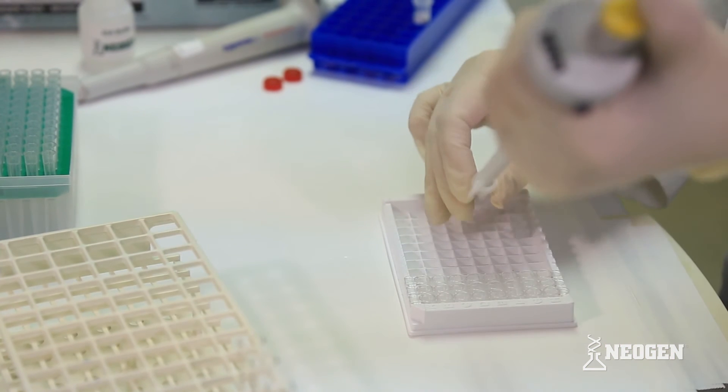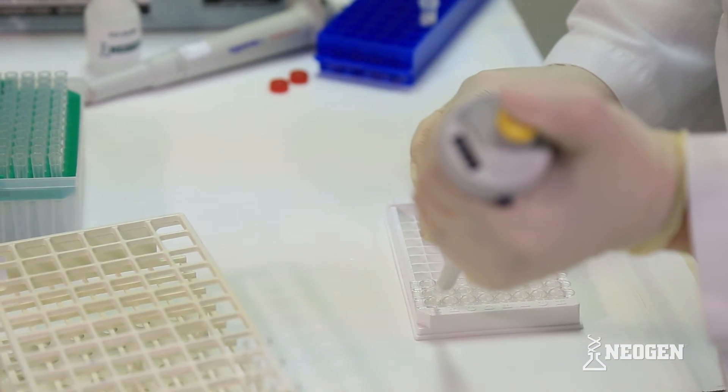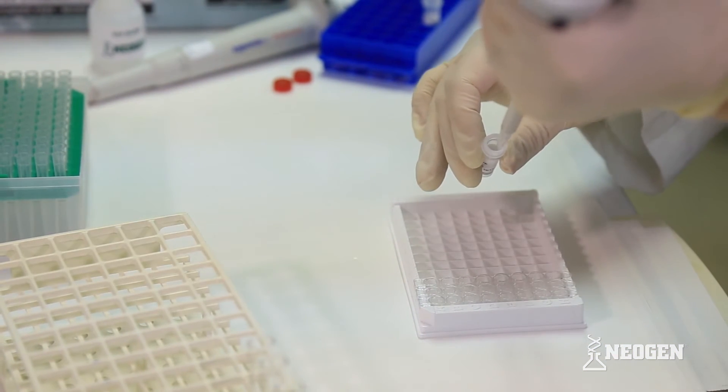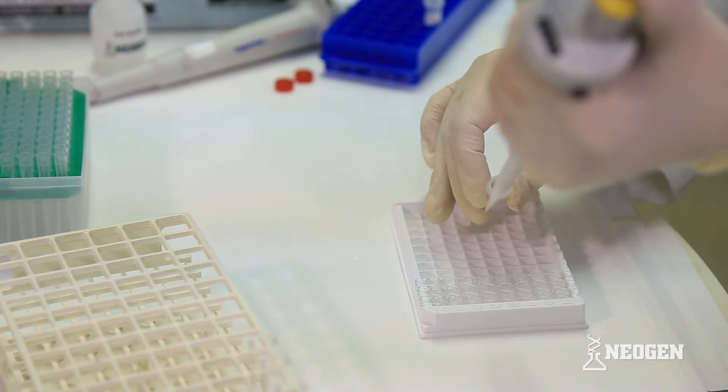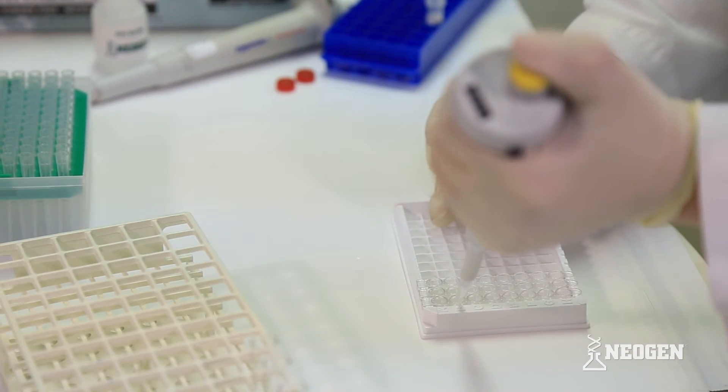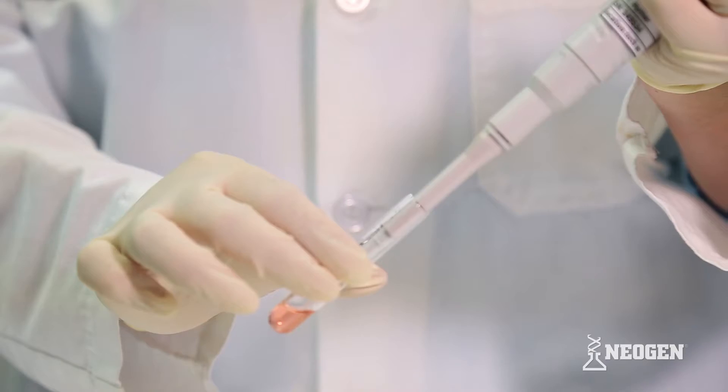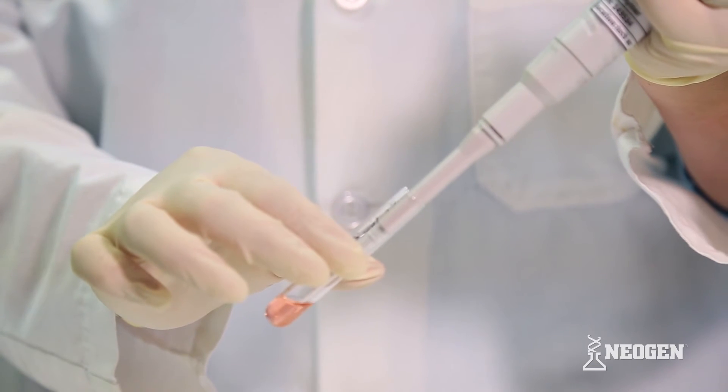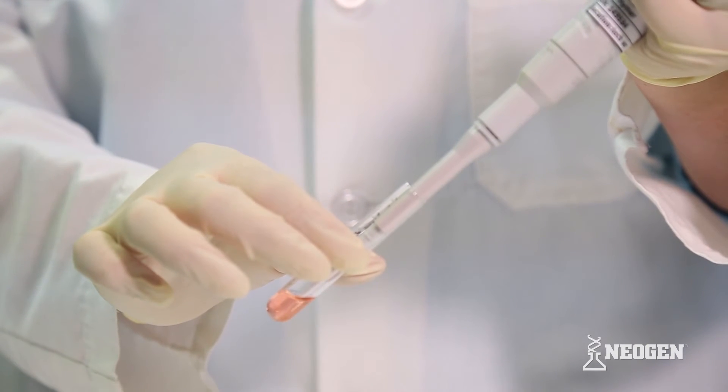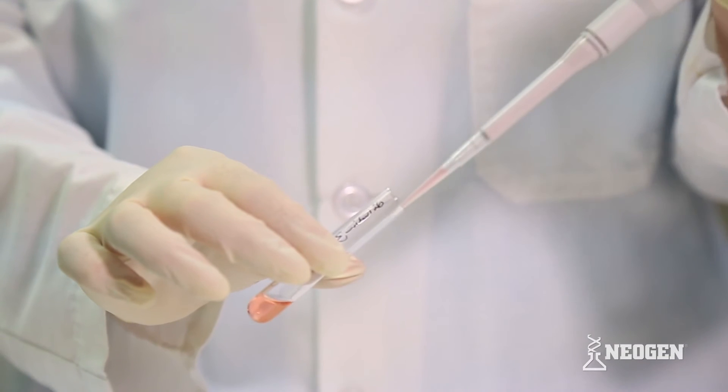Running the assay. Using a clean tip, add the specified volume of sample, calibrators, and/or controls into the appropriate wells. If your kit comes with calibrators, run the calibrators that match your sample type. For best results, prime the pipette tip before adding the sample into the bottom corner of each well at a 45 degree angle.